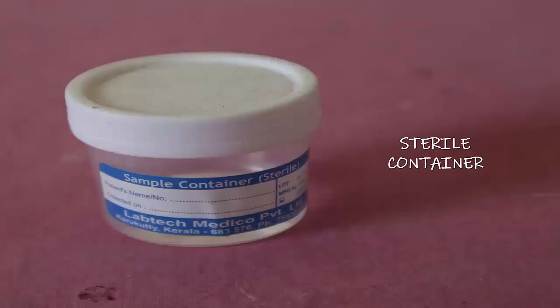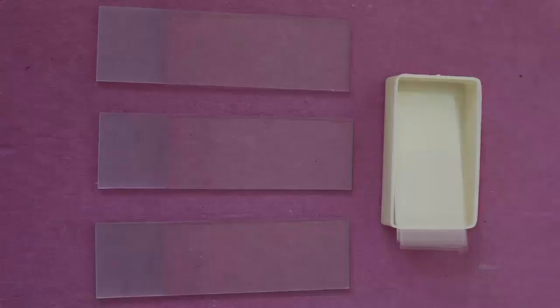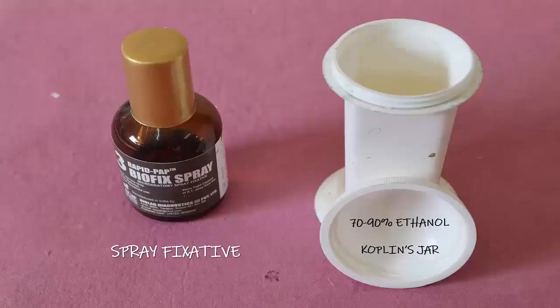Small sterile containers with tight lids containing physiological saline or a transport medium such as Hank's balanced salt solution should be at hand. Glass slides must be dry, free and clean of grease. Slides with frosted ends are convenient for immediate labeling. Wet fixatives such as 70 to 90% ethanol in Coplin's jar or a commercial spray fixative is needed.